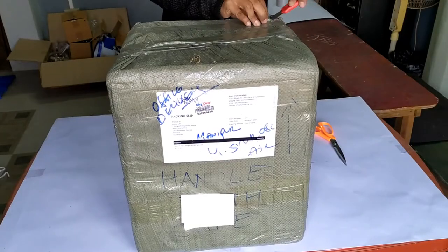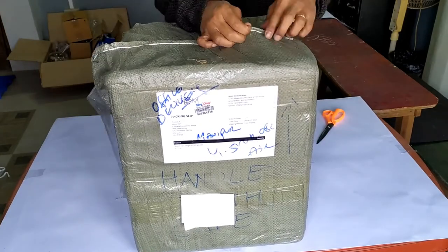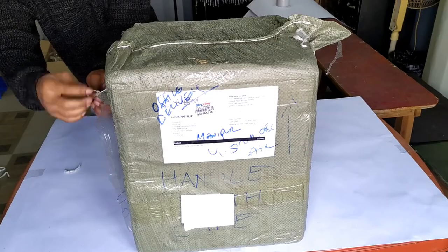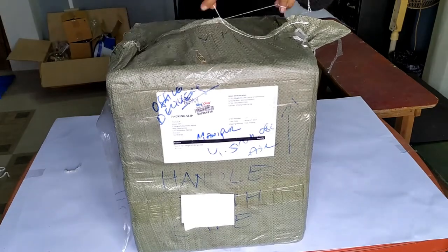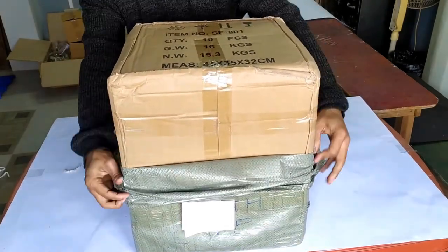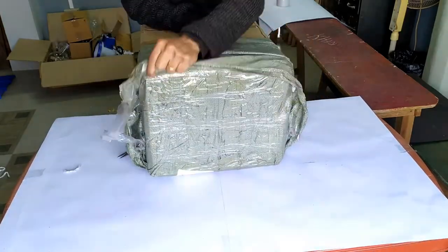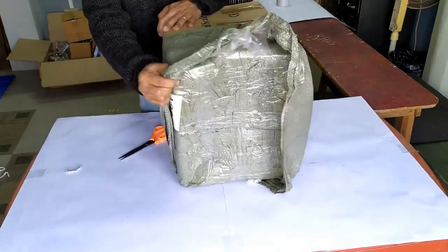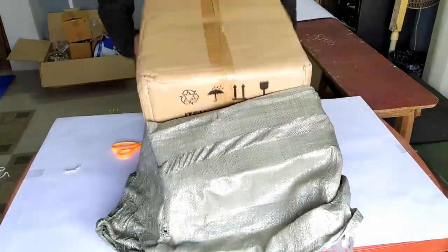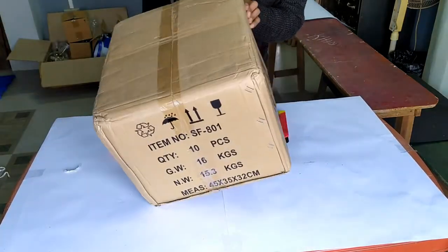The package came packed with an outer nylon mesh bag. And within this bag was the cartoon box with digital scale printed on the sides.